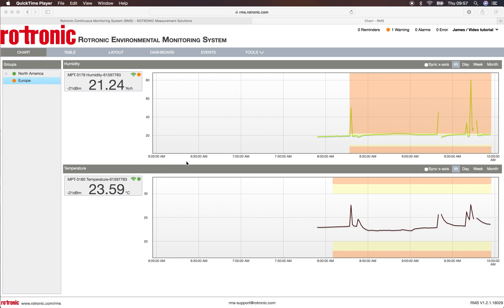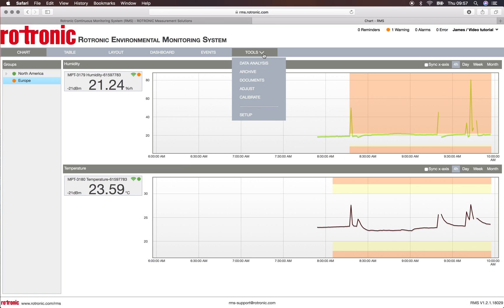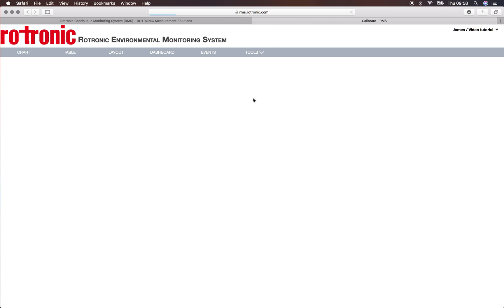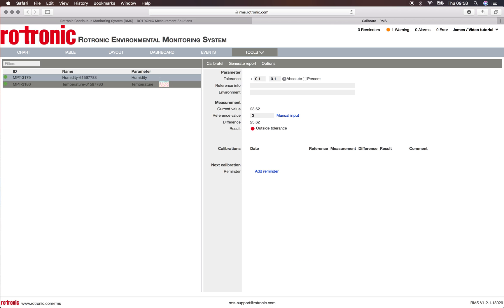Welcome to this RMS video where we'll be showing you how to calibrate your measurement points. The first step would be to go to tools and calibrate. Here we have two measurement points in the system, one for temperature and one for relative humidity.